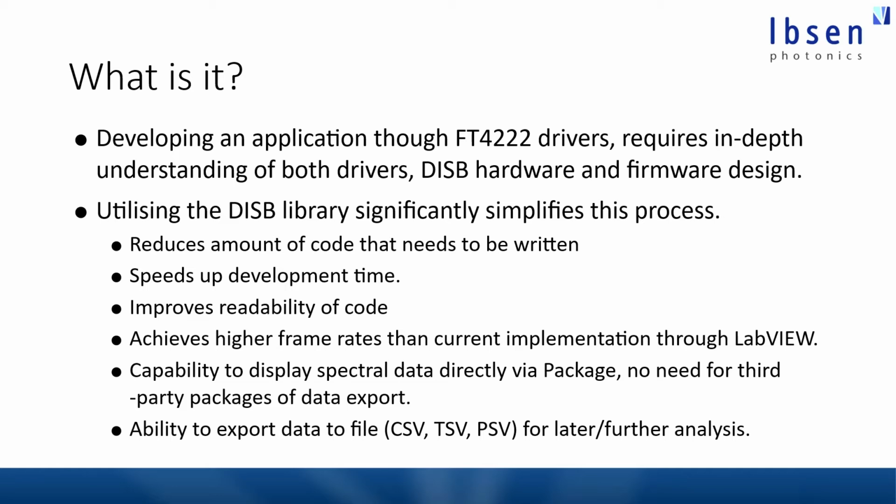It is also possible, at least from the measurements we've performed here, to achieve a higher frame rate than with the current implementation that we have through LabVIEW, and by that I'm referring to our evaluation program. It's also possible to use the package to display spectral data directly without the need for any third-party packages. So you can use standard C++ code, and you can ask to have displayed the last amount of spectral data that you acquired. It's also possible to export data directly from the package via function calls for later analysis, and you can export to standard format files such as comma-separated files or the like.